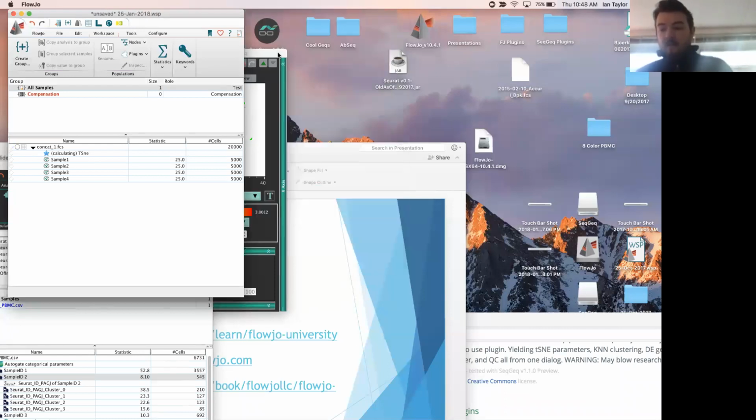Another question from a user. Can I concatenate two FCS files with a different compensation? The same parameters are measured, obviously, but slight differences in compensation are necessary in some cases. Very fair, very true, especially if it were a time course. In that case, I would recommend you not export uncompensated parameters, because as you will note, the acquisition-defined matrices in those cases, or matrices calculated in FlowJo in those cases, won't match. So in that case, simply choose export all compensated parameters instead. So it's a pretty simple workaround.